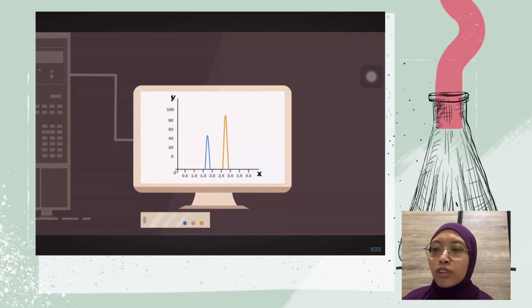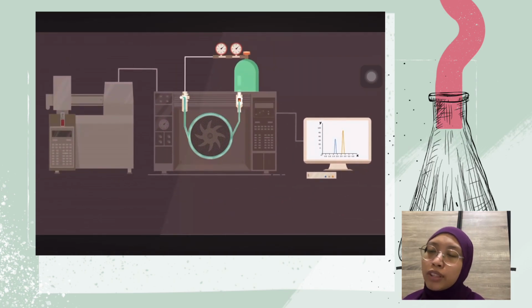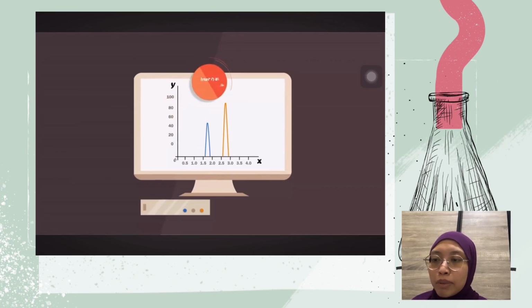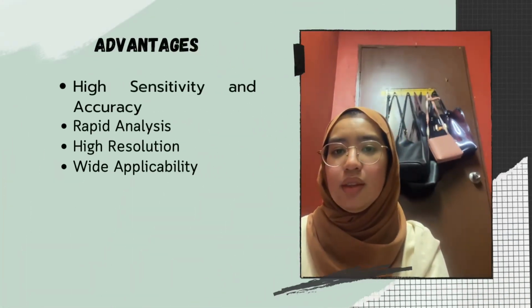Then, how does gas chromatography work? The sample is most commonly injected from a liquid autosampler. Then step 2 is through a septum, which enables the injection of the sample mixture without losing the mobile phase. Connected to the inlet is the analytical column.